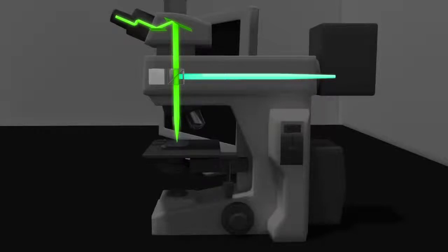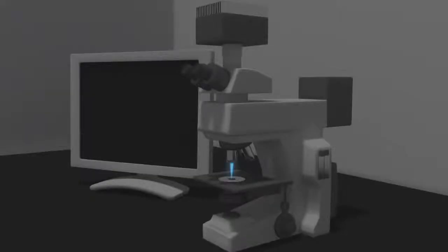One advantage to fluorescence microscopy is that it can be used to detect and visualize multiple fluorescent molecules by simply adjusting the excitation and emission filters to detect the relevant fluorophores in a sample. Fluorescent microscopy also has many useful applications in the laboratory setting.